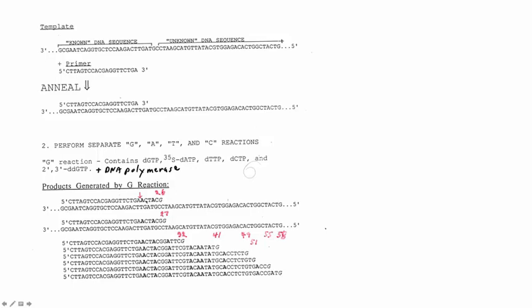These A's represent the S35 labeled dATP. In other words, now we have a radioactive strand right here that we can see on a gel. You have to have an S35 dATP added. If you don't have radioactively labeled ATP added before your first dideoxy, you're not going to be able to see that first G at all. So, getting back to all the strands that were made.